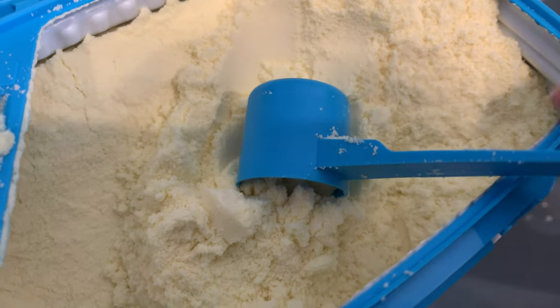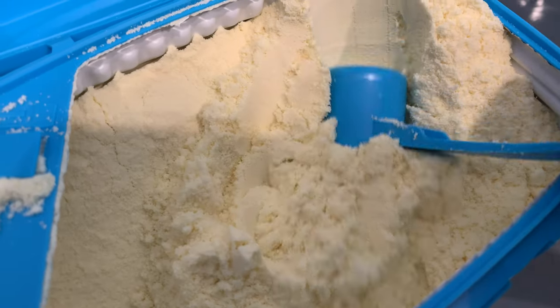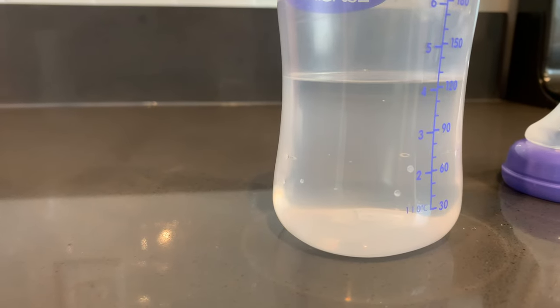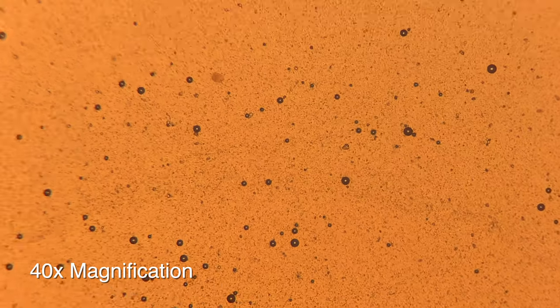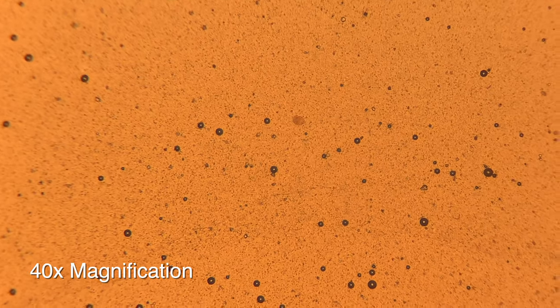Alright, enough talk about mammals. I've got some infant formula here that I wanted to compare against the human breast milk. So here's the infant formula. All of those larger circles that you're seeing are the air bubbles, and the smaller ones are actually fat globules.